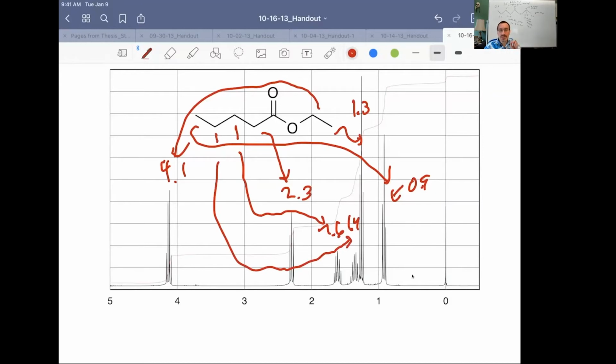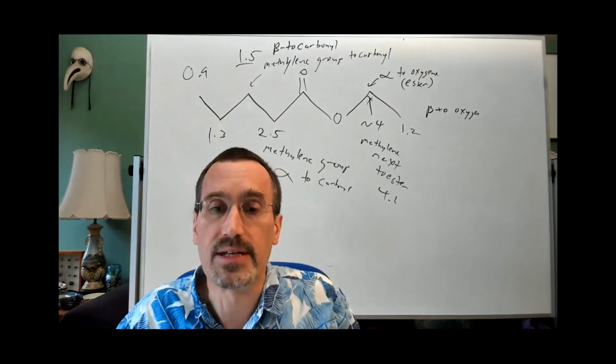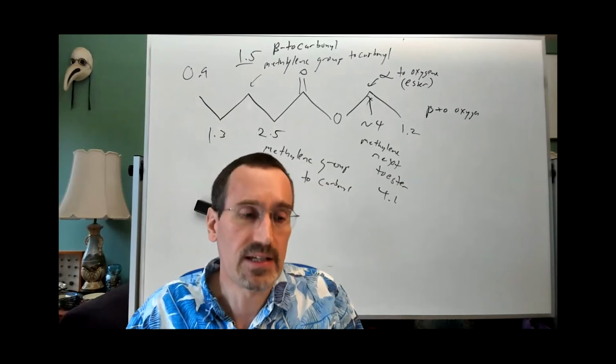So in other words, that little bit of knowledge that we have is very good for getting us to a point where we can pick out what the spectrum should look like. If we're off by a couple of tenths of a ppm, it's no big deal, but we know how to read the spectrum. And if you're good at internalizing this, you can self-correct. And if you draw a structure that doesn't make sense, you can fix it.